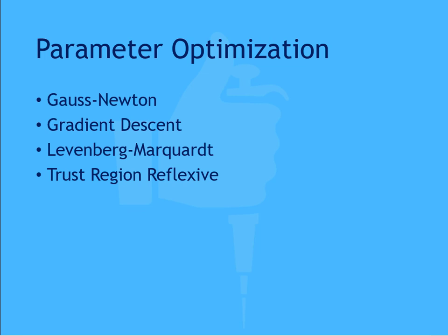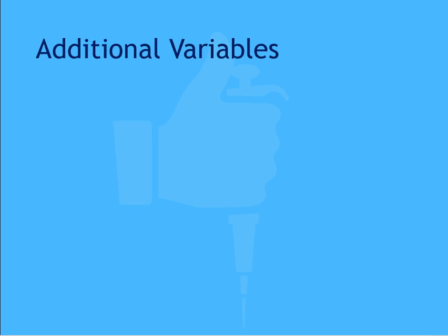In all cases, the goal is to minimize the sum of squares of errors between the calibration data and the model's predictions. In addition, the success of the fit will depend partly on the use of good starting estimates. If the software does not make good starting estimates, it might not find a good or closer fit.